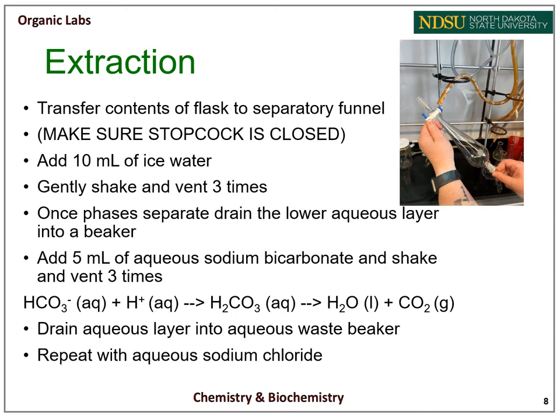Add 10 milliliters of ice water and place the lid on. You will then gently shake your separatory funnel briefly and then vent. When venting, do it as seen here, with your separatory funnel pointed up and angled. Opening the stopcock slowly is going to relieve the pressure inside.